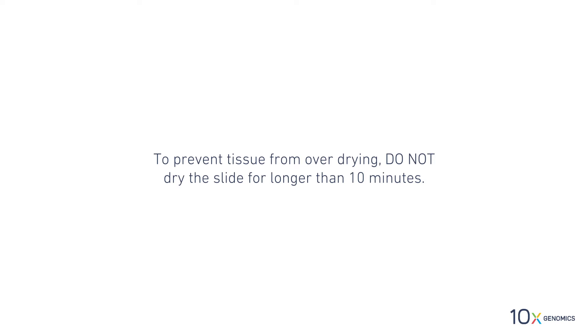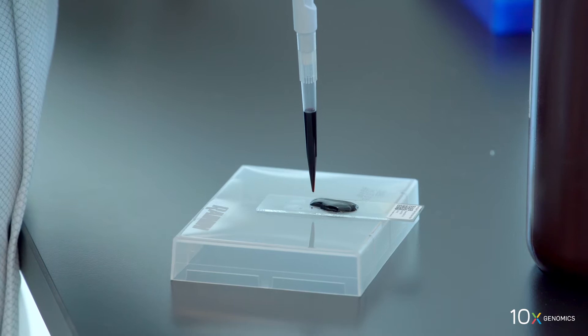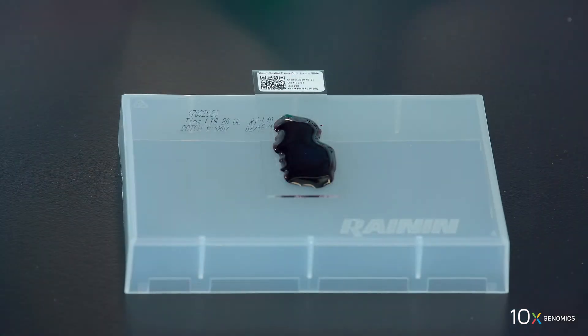To prevent tissue from over-drying, do not dry the slide for longer than 10 minutes. Next, we will add hematoxylin to the slide. Add one mil of hematoxylin to uniformly cover all tissue sections on the slide. Incubate for seven minutes at room temperature.